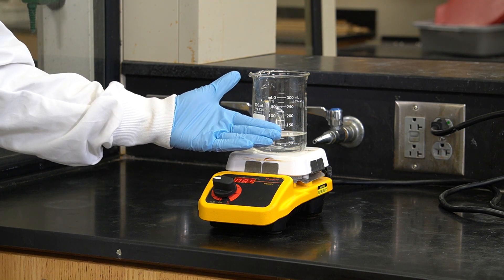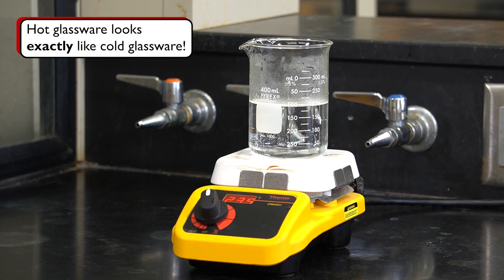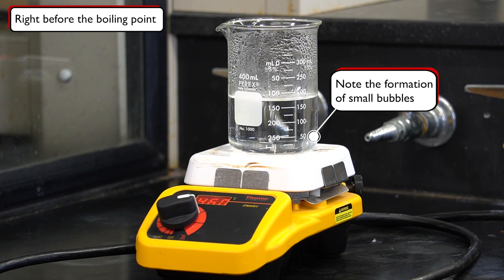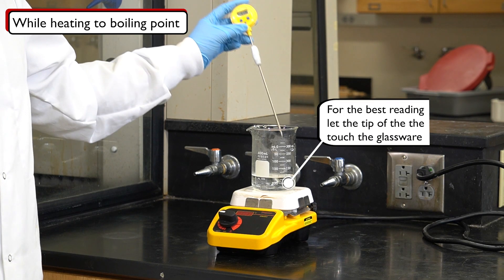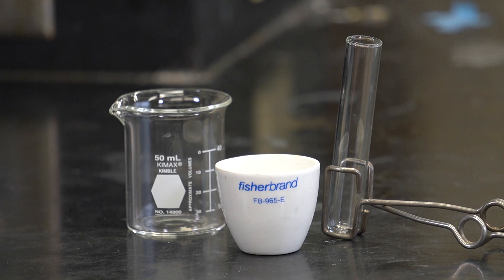Always assume that glassware is too hot to touch. Instead, check the temperature by hovering the back of your hand about an inch away from the glassware, or use a thermometer. Keep in mind that hot glassware looks exactly like cold glassware, so you might not notice any visual changes as it heats up. The only clear sign that a liquid is near its boiling point is the formation of bubbles. Always be patient while heating your reaction.